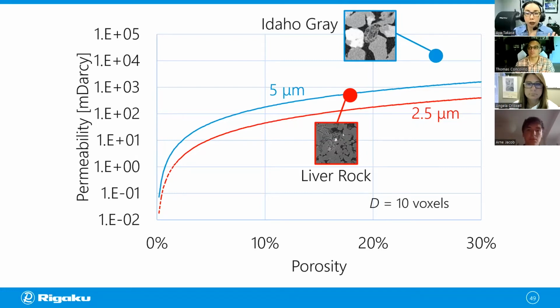Okay, so this is the end of the PowerPoint slide section, and then we're going to move into the lab. Let me get to the point to start a scan. And while we're waiting for the scan to be done, we can start taking some of the questions. Okay, so let me switch to the other camera, which I need to find. There it is.